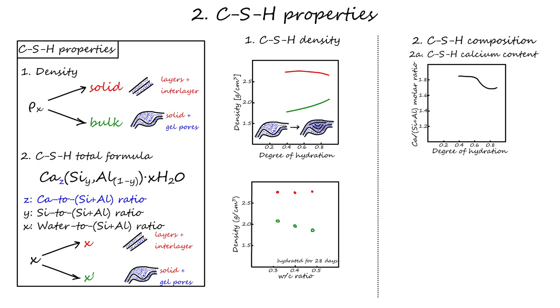This could be attributed to the formation of an outer product followed by an inner product, where the latter would have higher silicon and aluminium content. Certainly, the change is not surprising, since the fast-reacting C3S in the system releases calcium and silicon at a 3:1 rate, while the later reacting C2S releases calcium and silicon at a 2:1 rate.